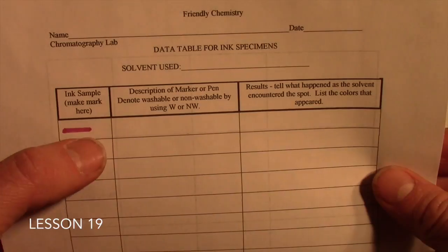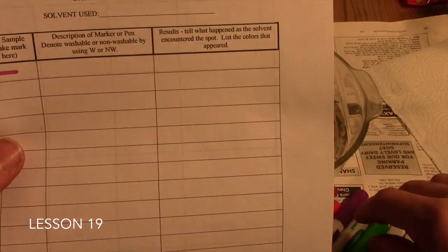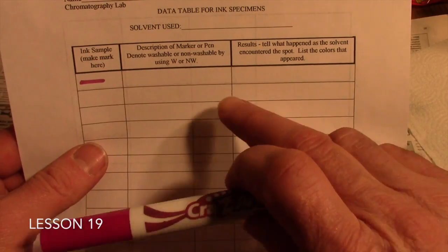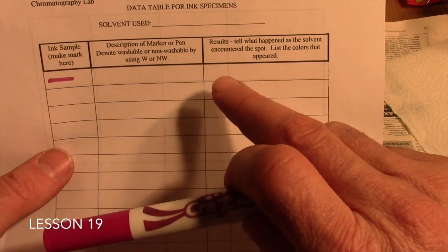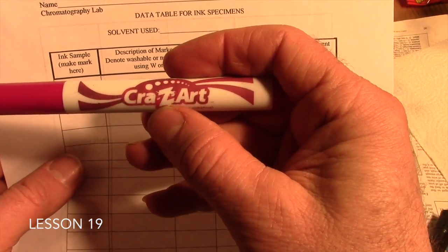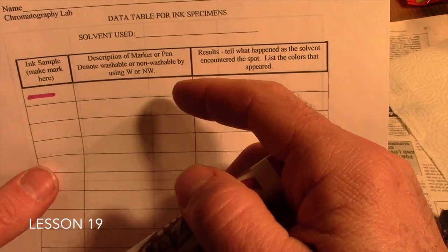The first column on the chart is a place where you can make a mark that shows the color of the ink sample. So our first marker that we're going to use, I've gone ahead and placed a mark that shows the original color of the ink. The second column over says a description of the marker or pen, and denote if it's a washable or non-washable marker. So in that space for this marker, we would just write that it's a Crazy Art marker and that it says, I believe right here, it's a washable marker. So we put a W for washable.